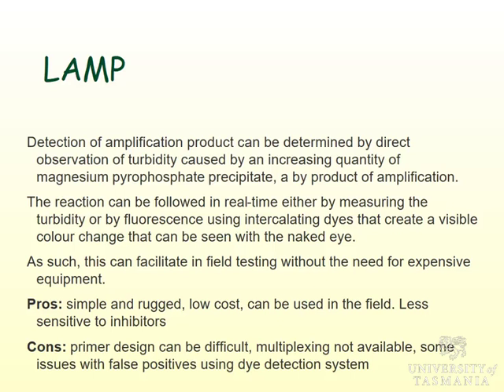They run up, and we look for the band size. So if we get a band of 1,000 or a band of 300, we know we've got those 2 viruses, but not the other one. So that's called multiplexing. We have multiple testing in the one tube. So that, again, adds efficiency, reduces the cost, allows you to test more things. Not that easy with LAMP because of the number of primers you need.